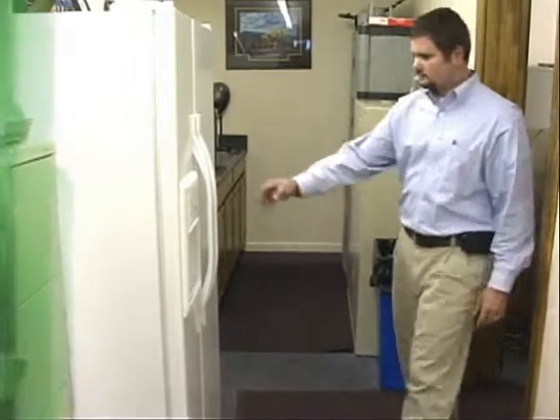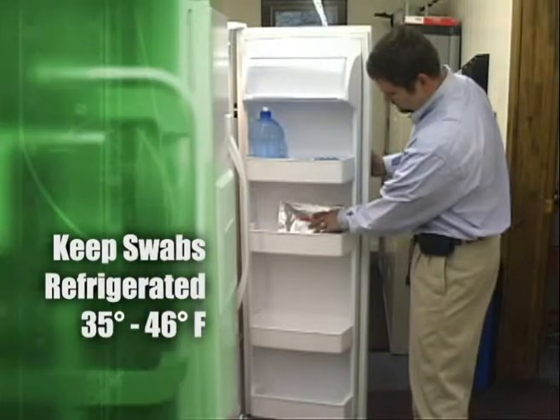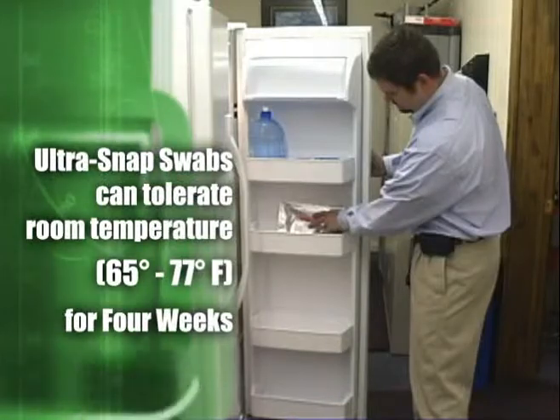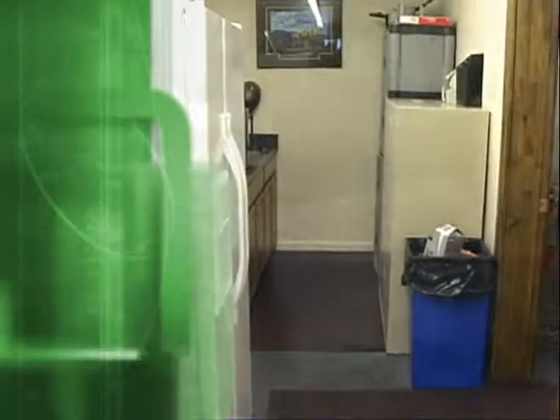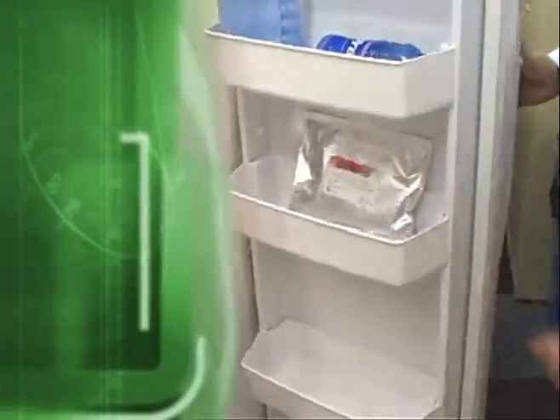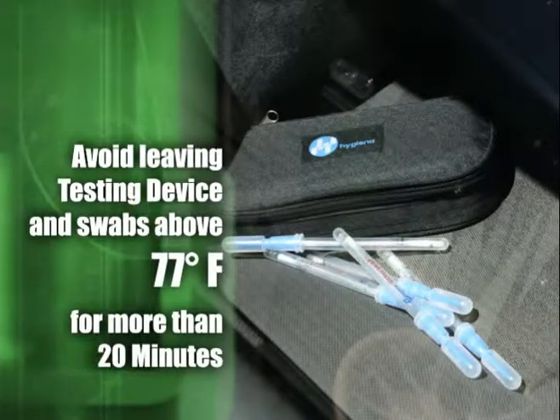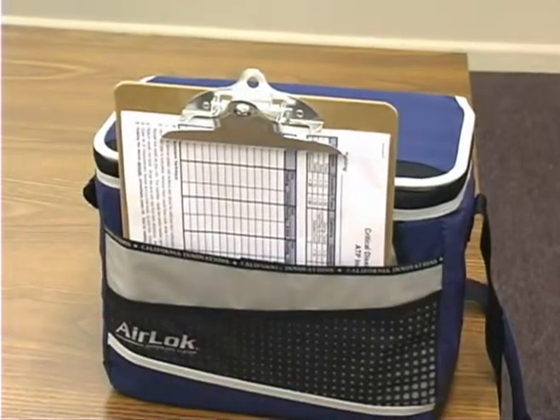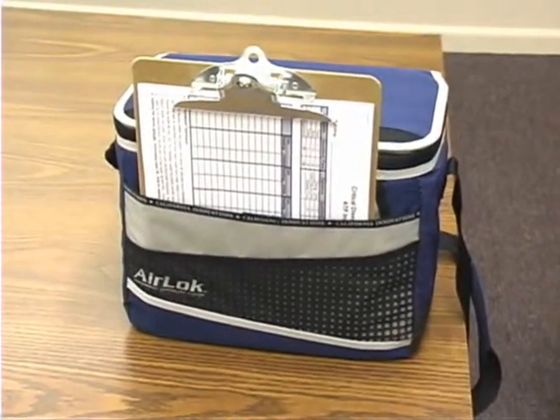To ensure a shelf life of up to one year, Ultrasnap swabs should be refrigerated at 35 to 46 degrees Fahrenheit. Swabs will tolerate room temperature, 65 to 77 degrees Fahrenheit, for four weeks, but should be refrigerated when not in use to ensure longevity. You should always avoid leaving the testing device and swabs in temperatures above 77 degrees Fahrenheit for more than 20 minutes.